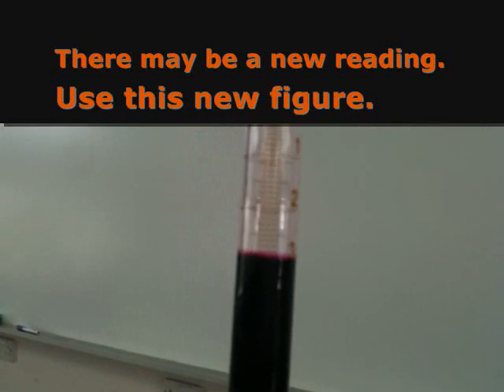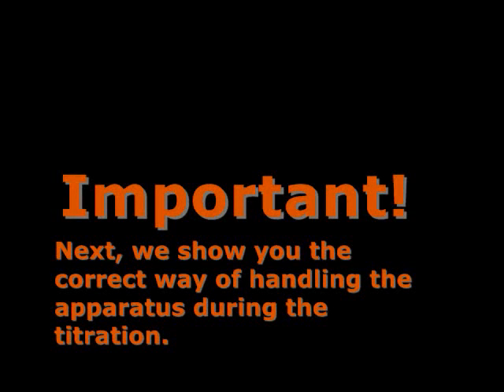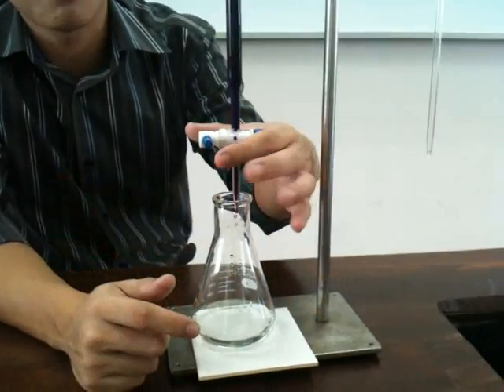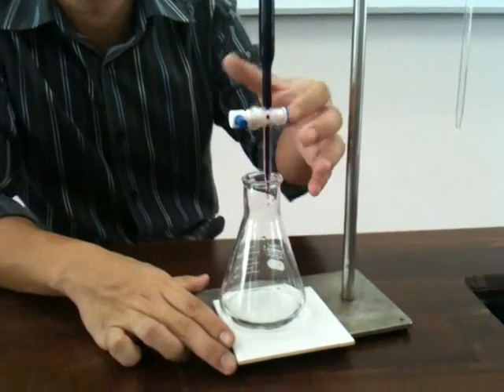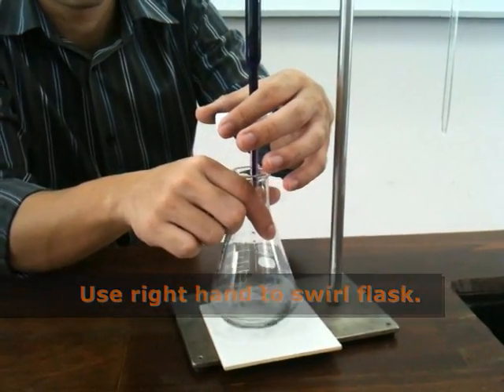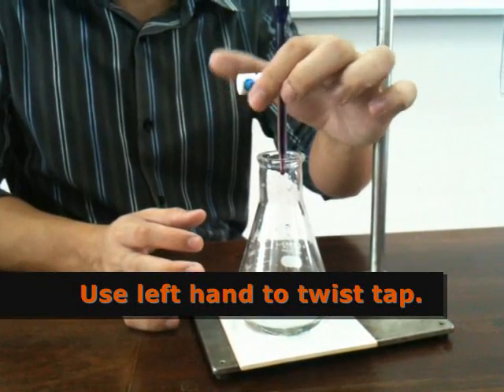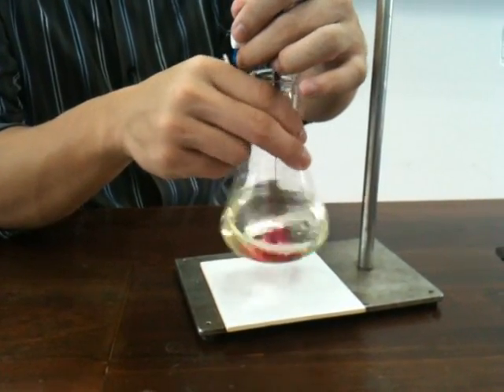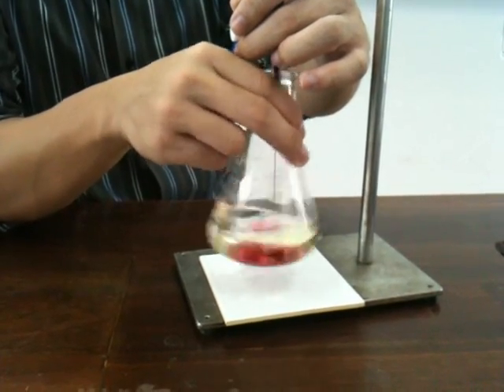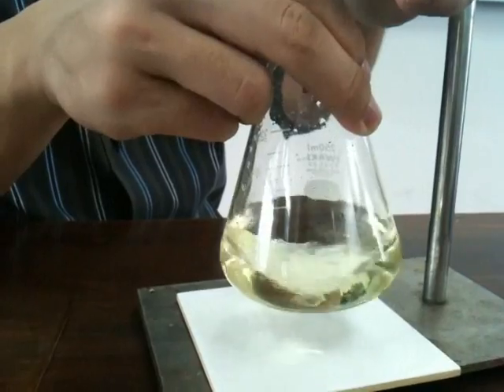Previously it was at 3.0 cm³, but now it's at about 2.9 cm³ after leaving it for about 5 minutes. This is the figure you will start off with — write it down. In this step, use your left hand to turn the knob while you use your right hand to stir the conical flask. If you are right-handed, use your left hand to twist the knob and your right hand to swirl. As you get closer to the end point, add drop by drop.